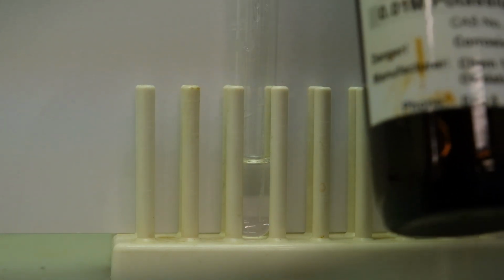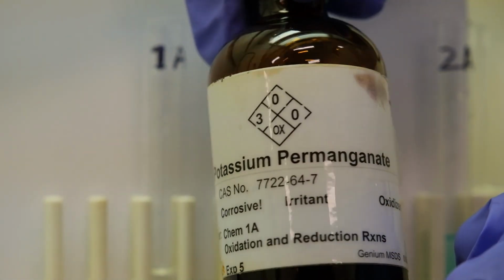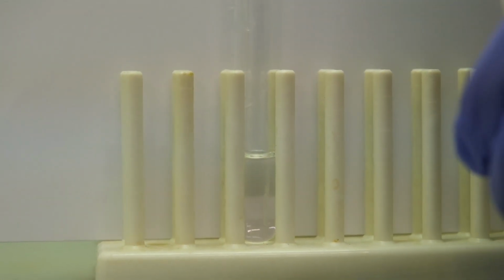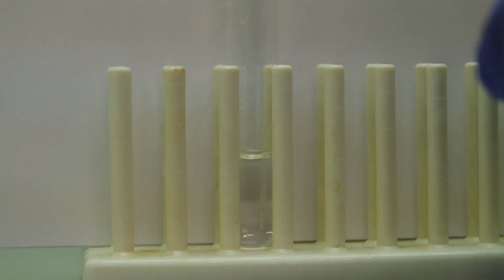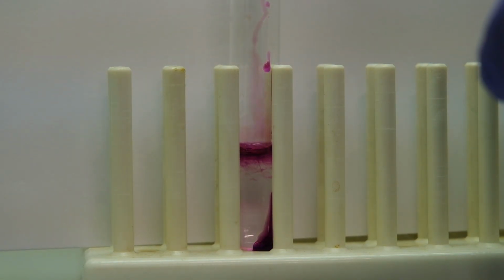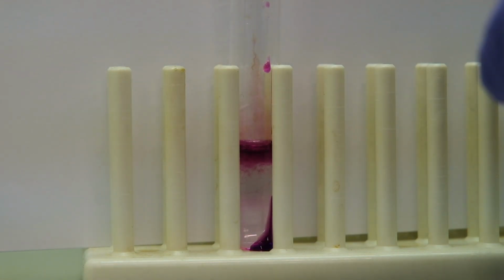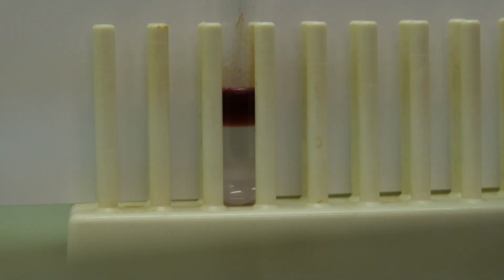Now we're going to add 10 drops of the 0.01 molar potassium permanganate. So record the observations you see about system 3A.